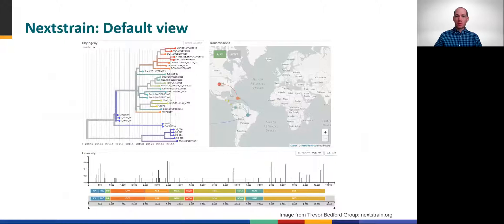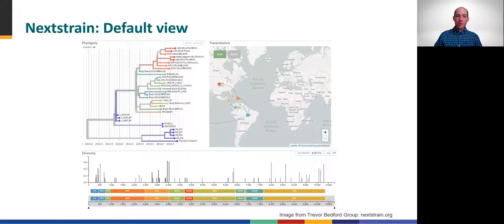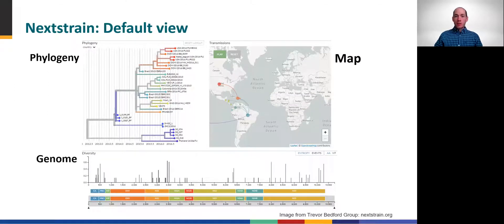Nextstrain is a powerful tool for many purposes, but especially for data visualization. If you have visited nextstrain.org or seen any reports from the Nextstrain team, you will recognize this default three-panel view: a phylogenetic tree, a geographic map, and a genome sequence map, which together provide a comprehensive look at your data.